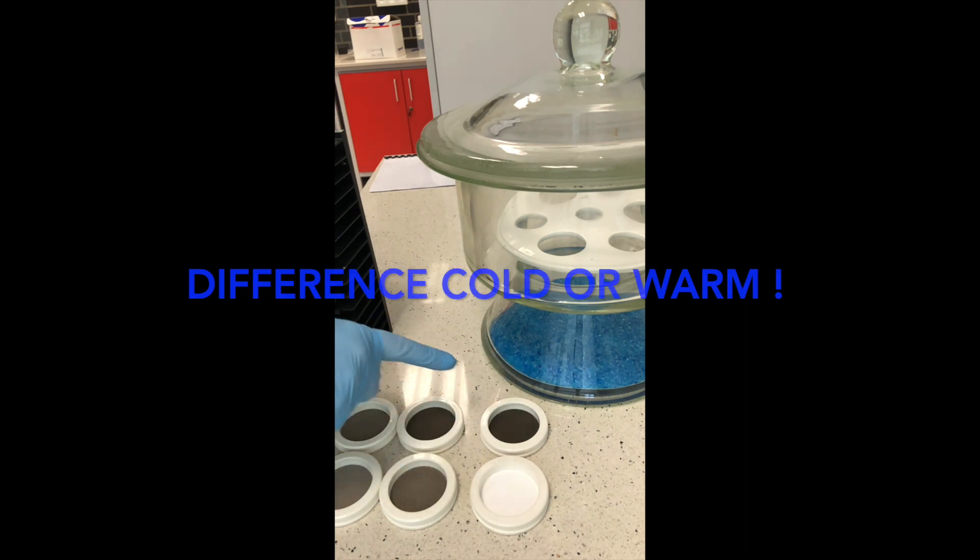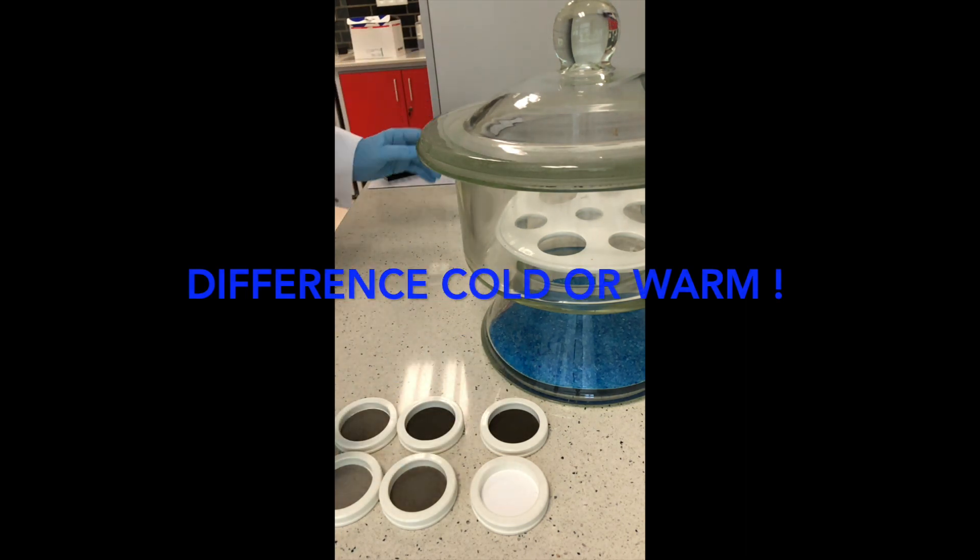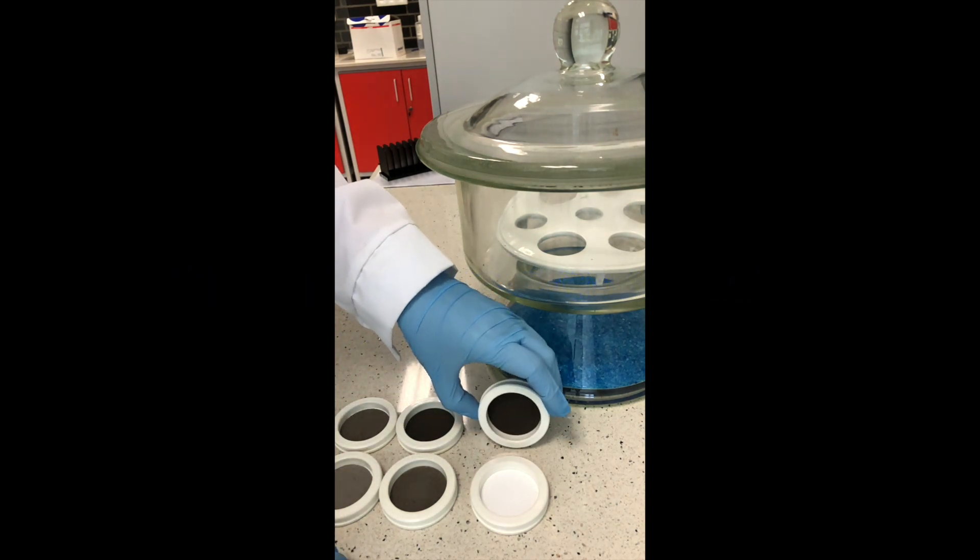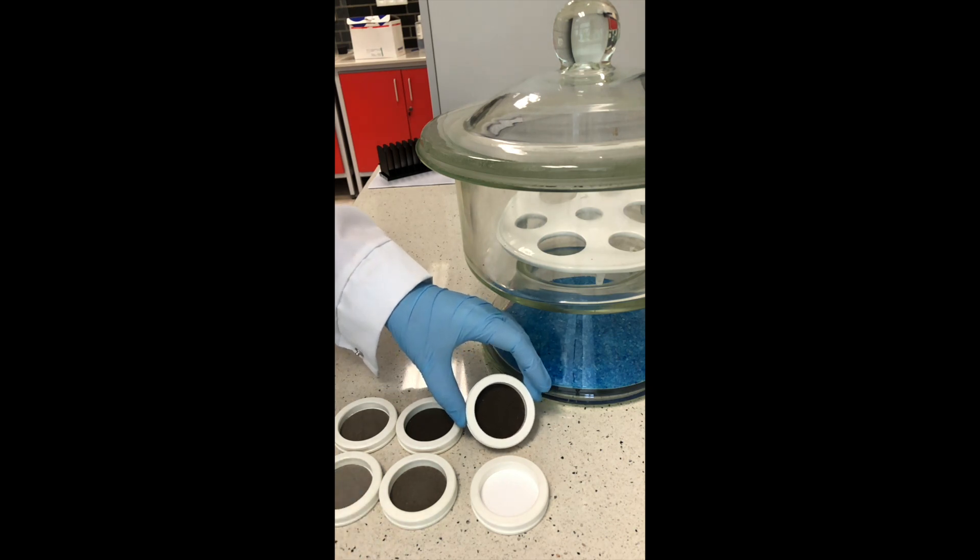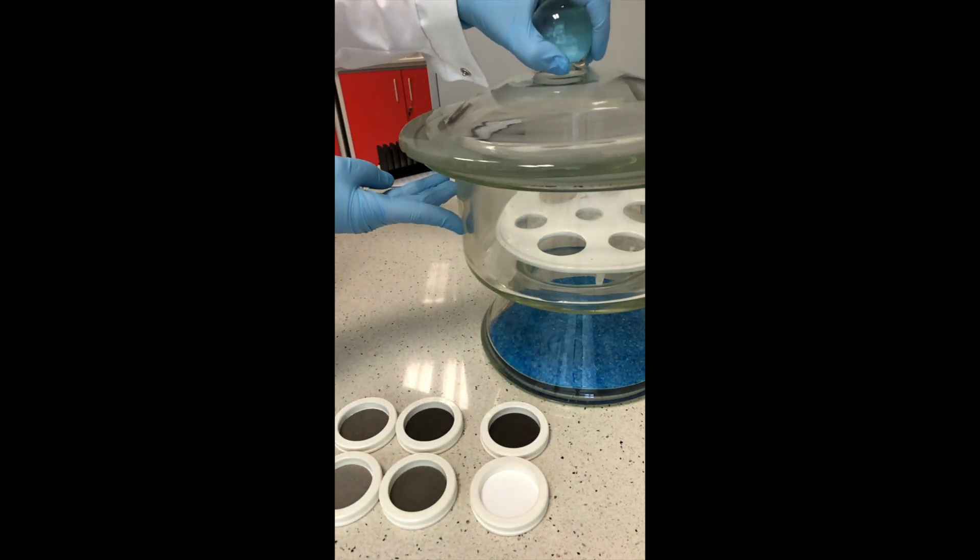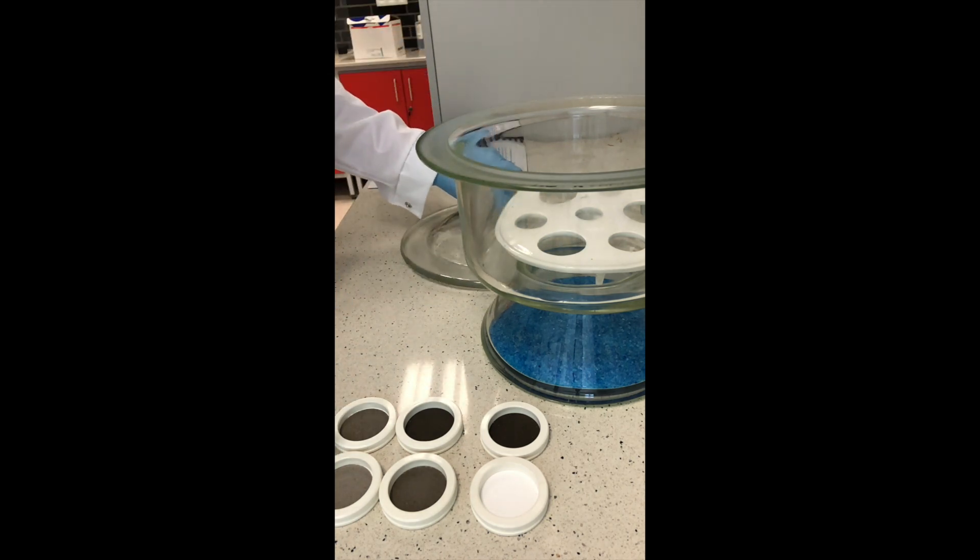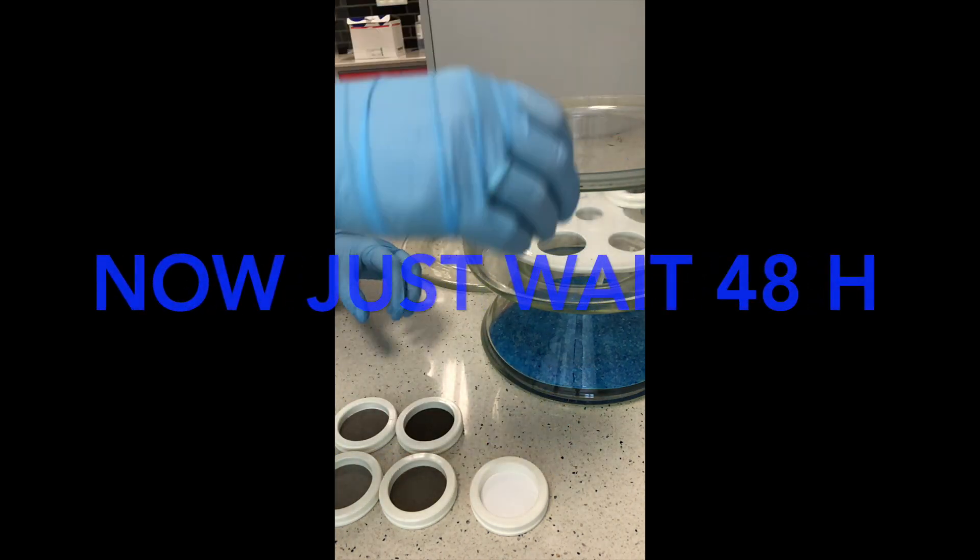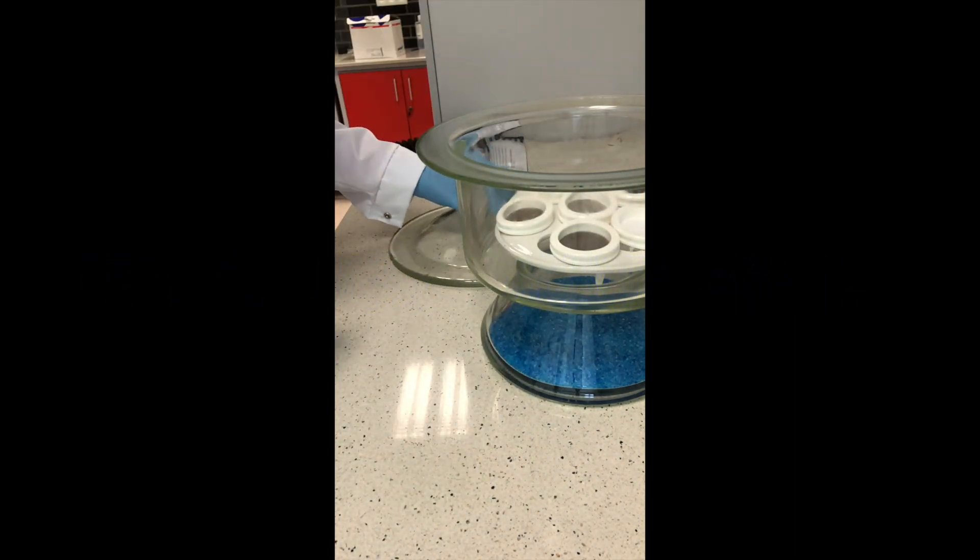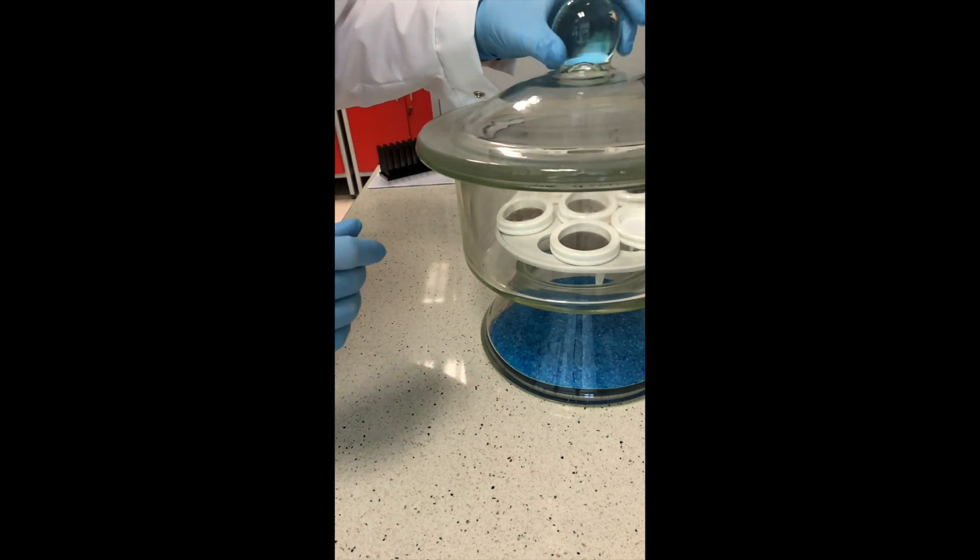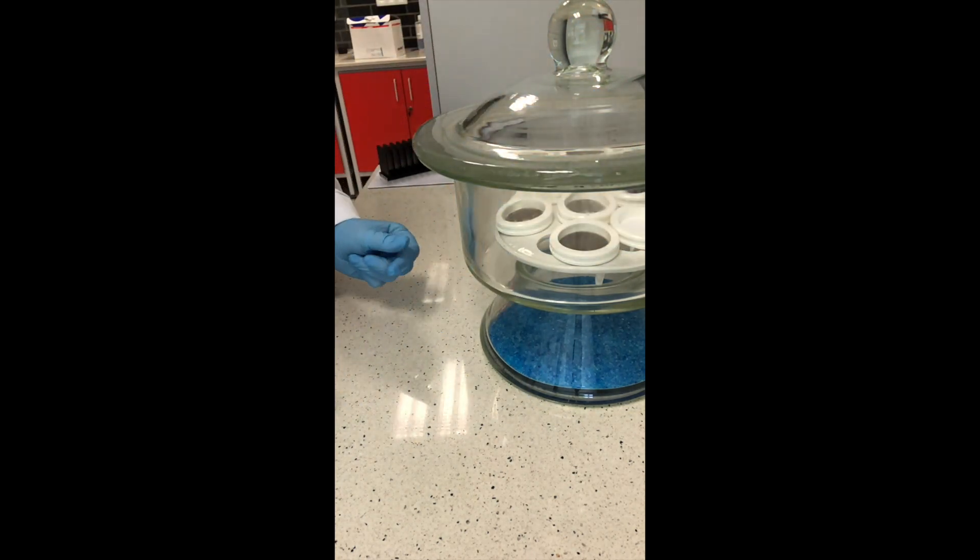When you look at the filters you even see the difference if there was a colder day or a warmer day. On the colder day the filter is darker. It is connected with soot, so unburned coal which is in the flue gases. What you have to do is put the filters in the exsiccator and wait 48 hours. After 48 hours, after they are conditioned, you can weigh the filter on the balance.